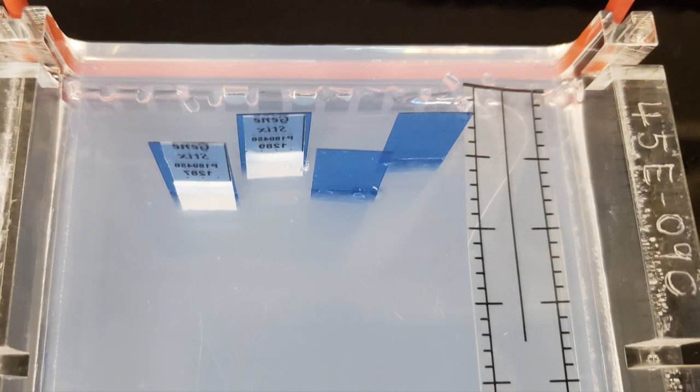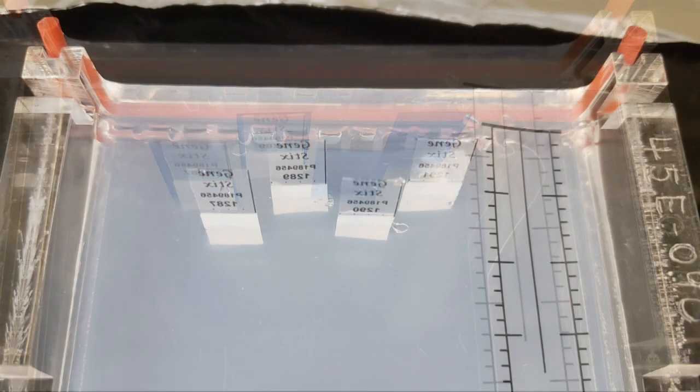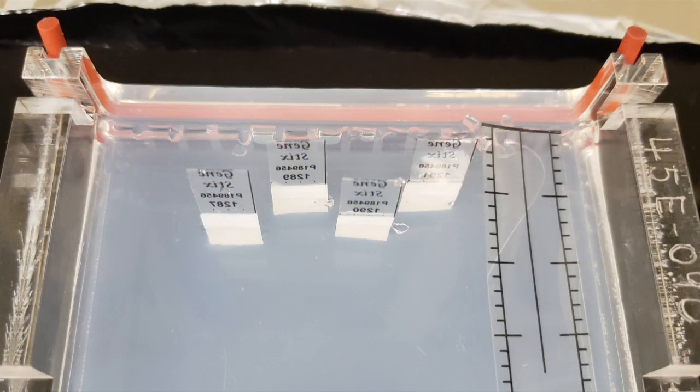With the DNA locator tab still in place, insert the GeneStix into the gel by sliding them behind the DNA locator tabs. Remove the DNA locator tabs so that the GeneStix is left in the gel.